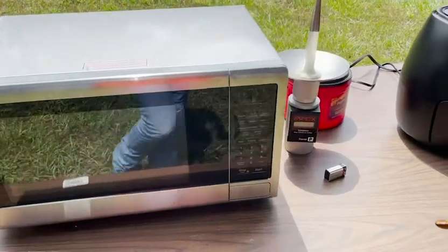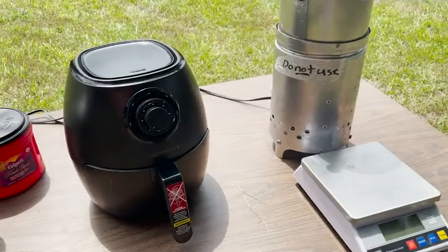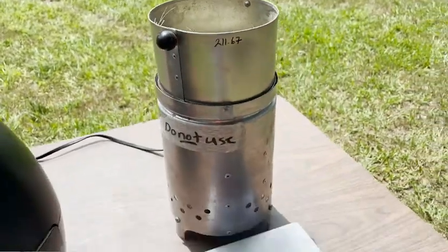We have several tools here that we can use to try to estimate the dry matter of the hay. One that would be quite important is the scale, because you need to weigh the initial material.